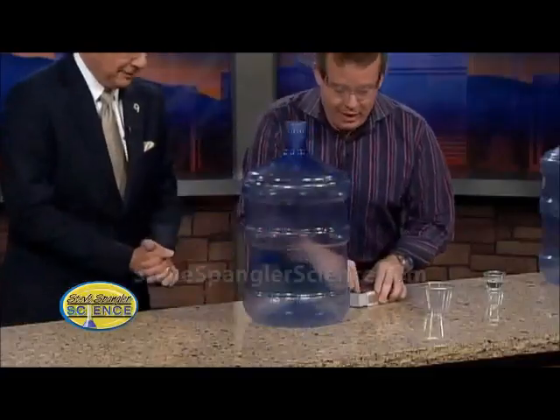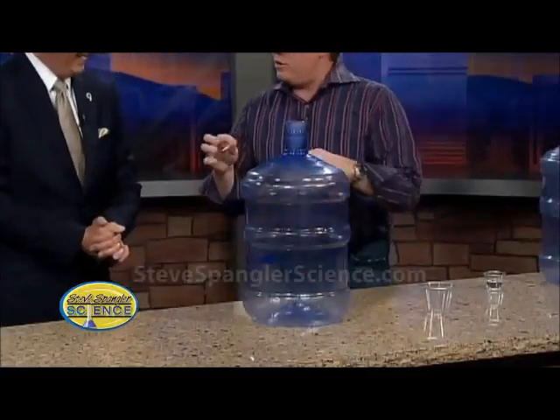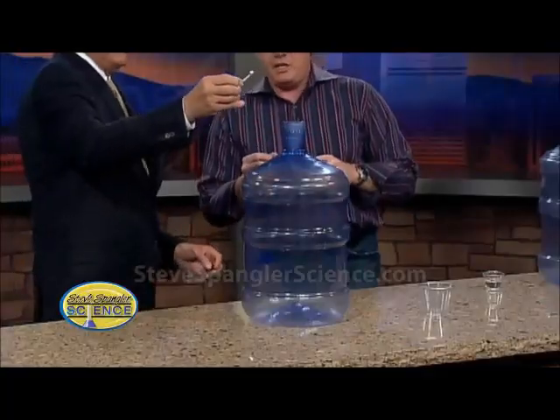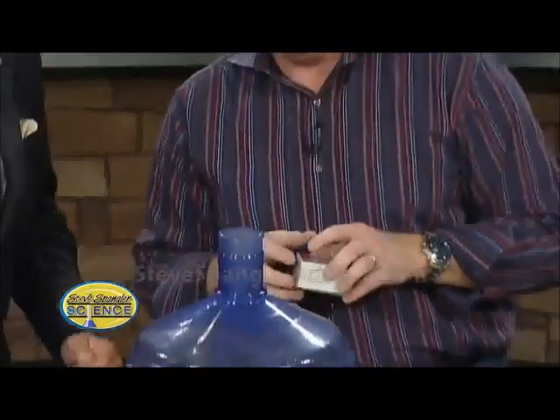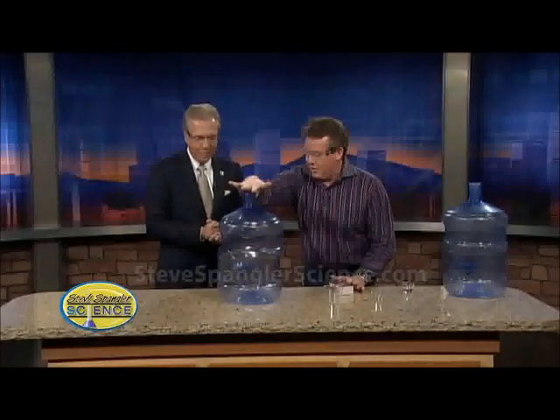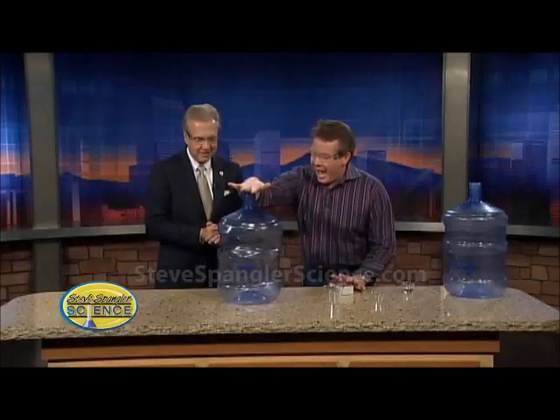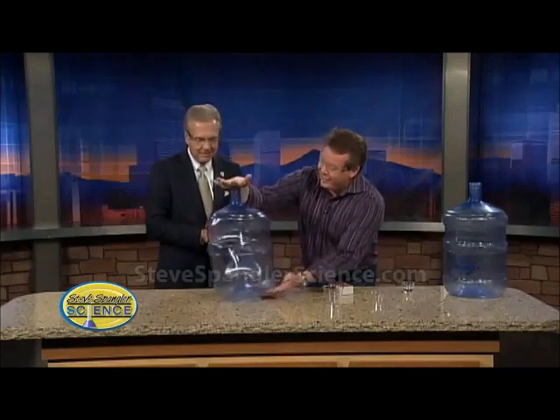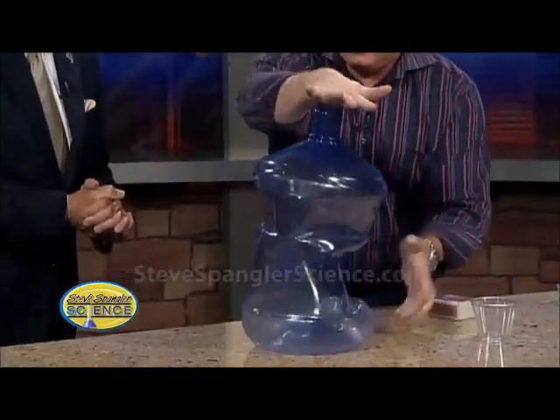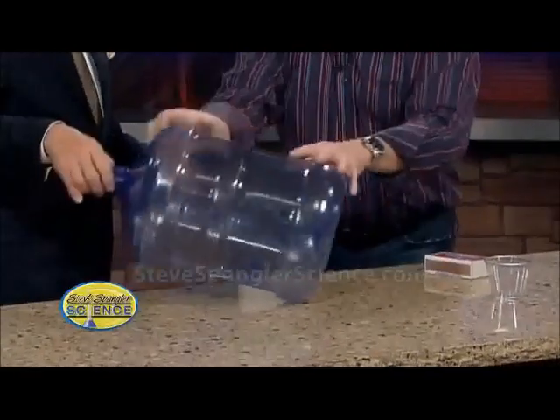All right, so here we go. A little match here — I'm just going to kind of drop it down inside. Now watch — I'm going to cover it. For heaven's sake, look at this. You're actually crushing the bottle! Now I'm not doing that. The air all around us is crushing the bottle. Isn't that amazing?